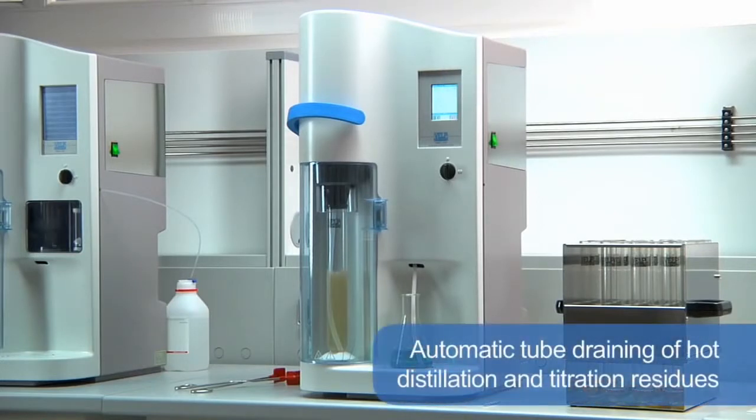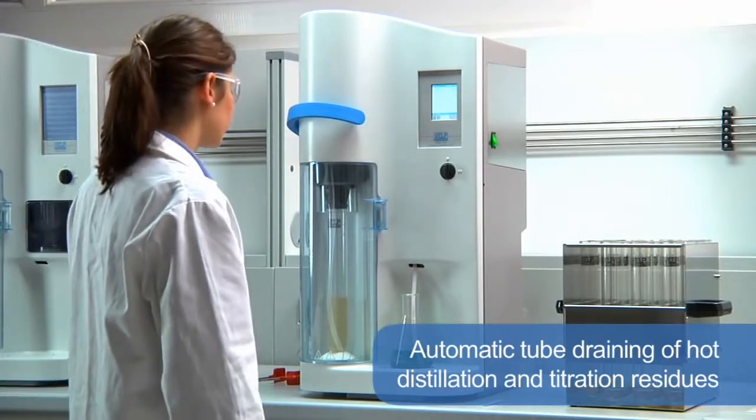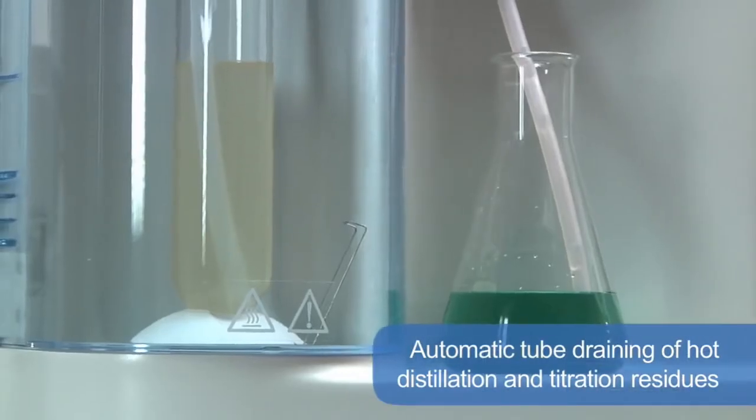Automatic tube draining of hot distillation and titration residues increases operator safety, saving time and reducing manual activities.